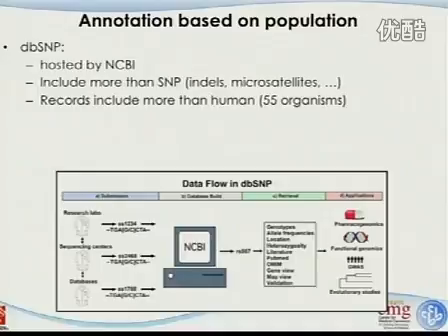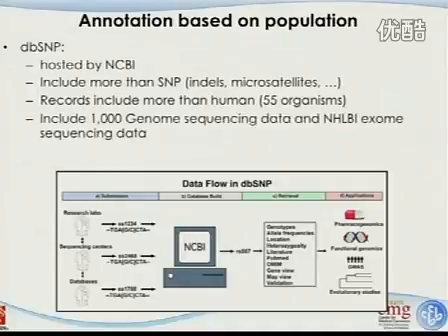So if we study animals, this is a good source to look into as well. Now it includes 1,000 genome sequencing data and the NHLBI exome sequencing data. So they have multiple data sources in their database already, and this is one stop that you can really go to.